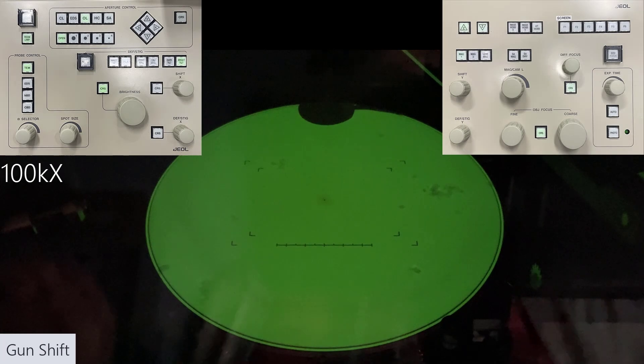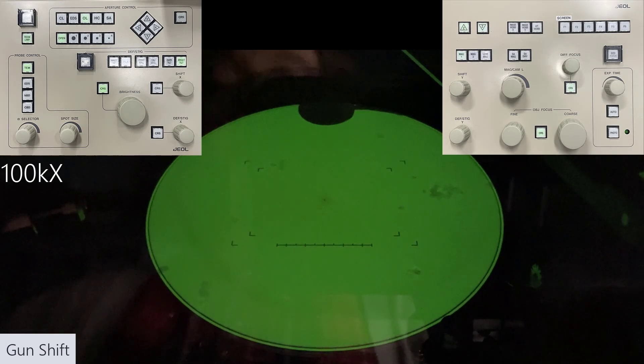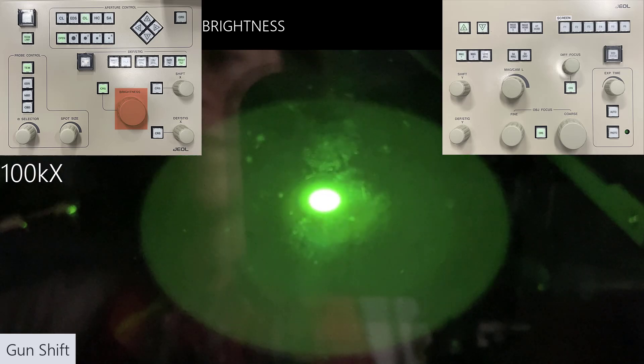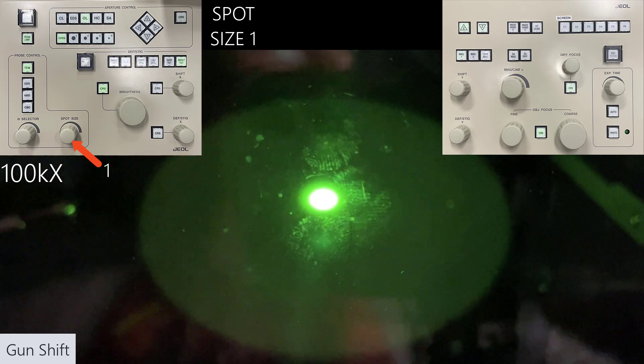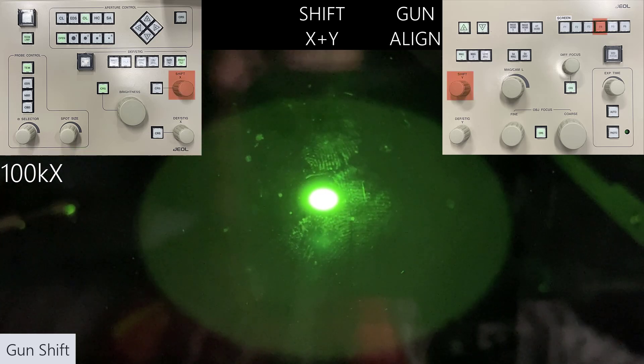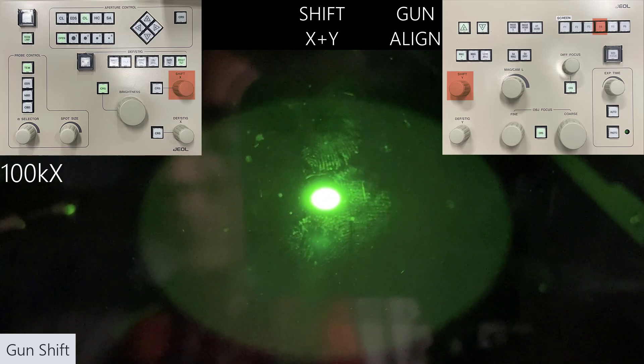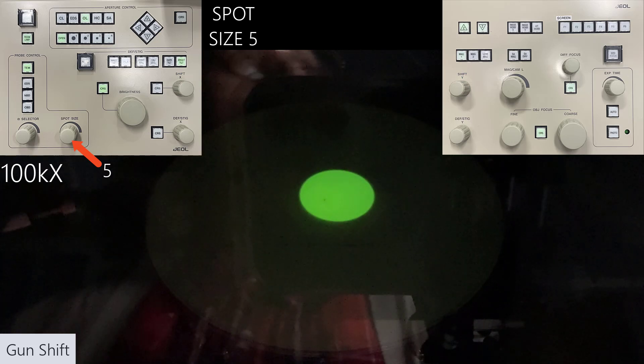Those optional alignments are things I typically do once a month, but it's a good idea to run through them if collecting really high quality data or if it hasn't been done in a long time. If you're going to do these advanced alignments, do them first before the required and optional ones. For the gun shift, at 100,000 times magnification, condense the beam with the brightness knob using spot size 1. Select the gun align button — mapped to F4 — and use the shift X and Y knobs to center the condensed beam on the phosphor screen. Then go up to spot size 5 and condense the beam again.